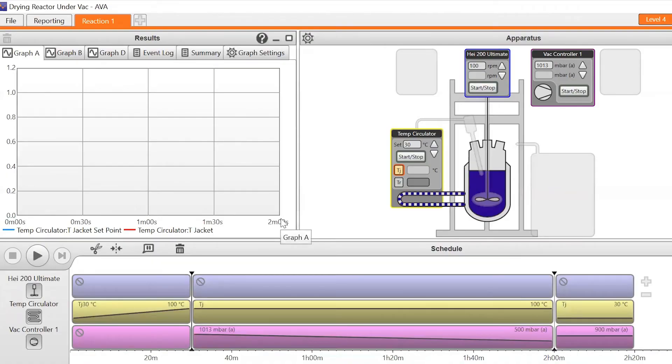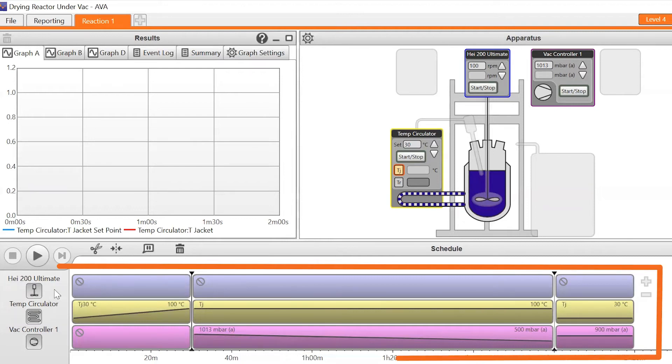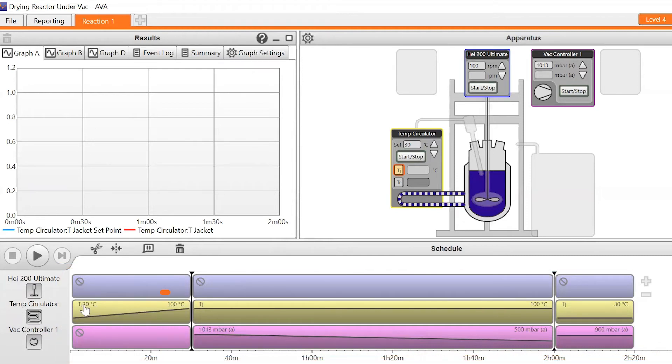With Ava, we can use an overhead stirrer and also a circulator for controlling temperature, normally on jacket control, even if a process temperature control is attached to the system. We can have a vacuum controller connected to a vacuum pump and then put in a simple program to control the jacket temperature to, for example, 100 degrees centigrade, and hold at 100 degrees for a period of time. Simultaneously, we can ramp a vacuum down to approximately 500 millibar.